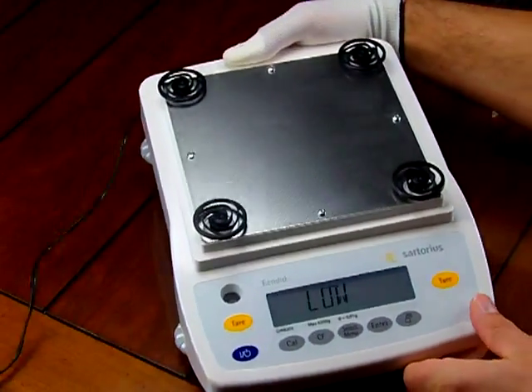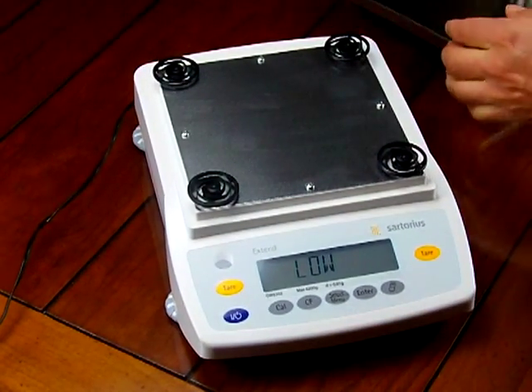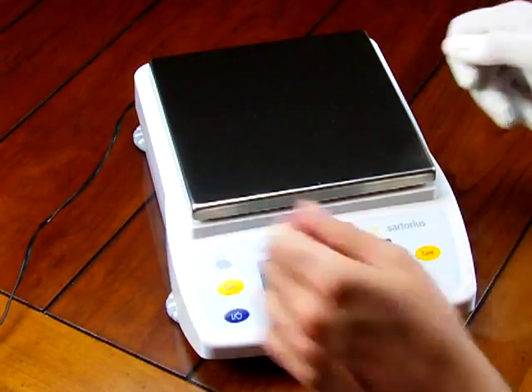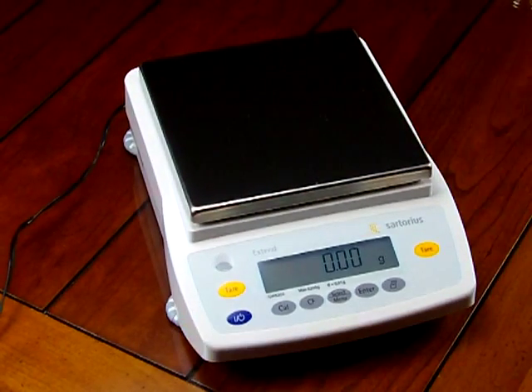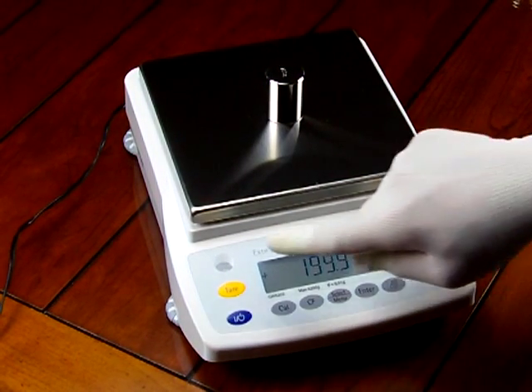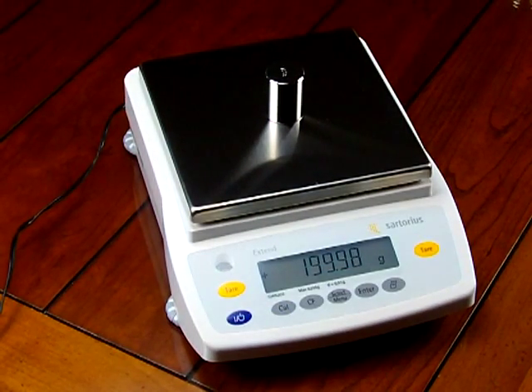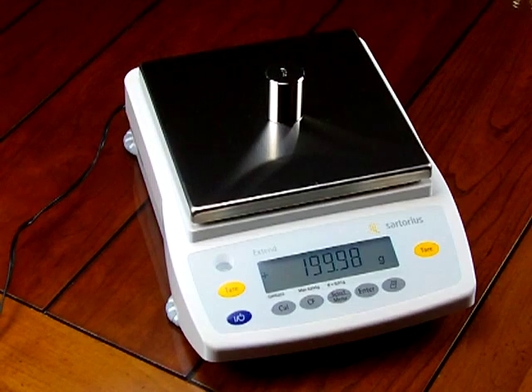These are really nice features to compare when shopping for a balance. We can tare the balance and put our 200 gram weight on — and there you have it. Features to look at: the Sartorius also offers a spirit bubble level in the top left-hand corner for leveling the balance. It appears off right now because the balance is not level — we just lifted it up. You always want to re-level your balance.